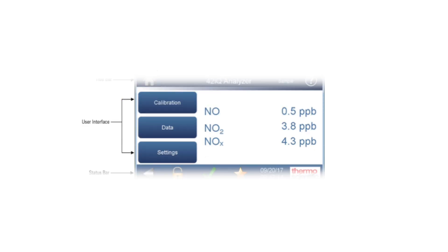The middle, or user interface, includes calibration buttons where you can calibrate the instrument, set up auto calibrations, and view calibration data. The data button shows real-time data and graphs. And the settings button shows real-time status and alarms, along with other diagnostic tools.